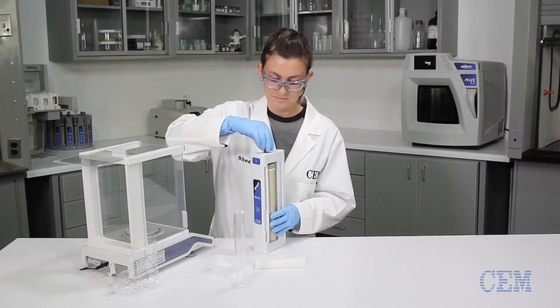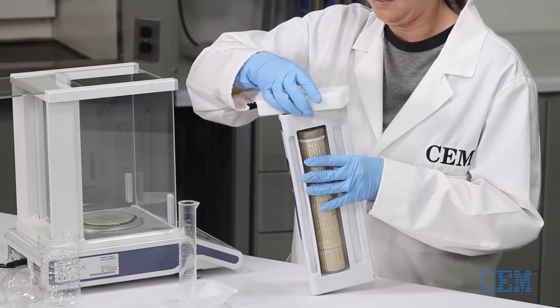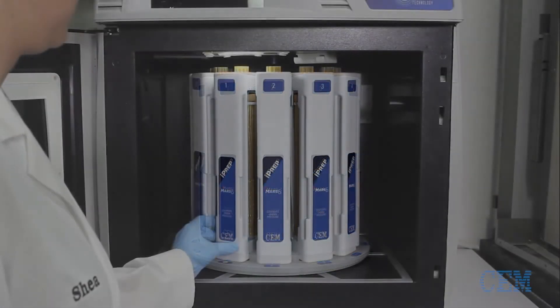With I-PREP, all you need is a simple hand tool to seal the vessel. There's no need for heavy duty wrenches. The vessels are then loaded into the carousel and the samples are ready to digest.